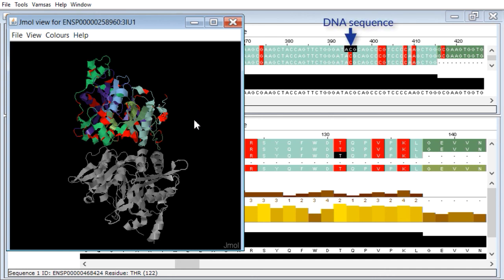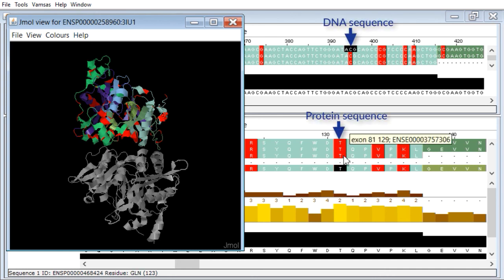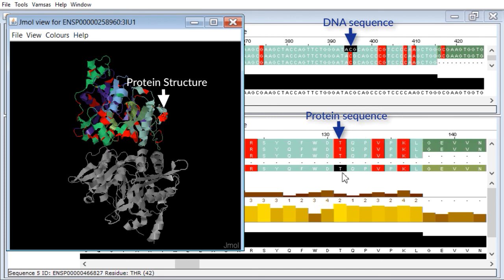So we've gone from sequence variants straight through to structure variants, from genome to protein structure, with almost no effort at all.